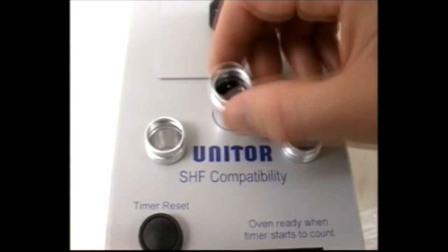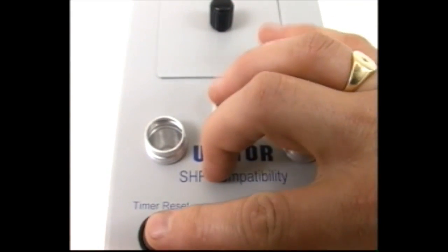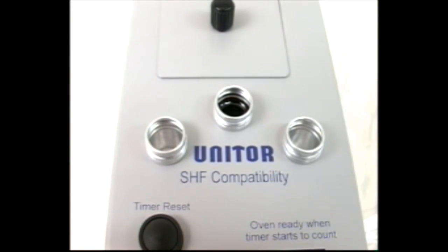After the unit is fully heated to 100 degrees, place the tube in one of the preheat holes. Press reset, then wait for the timer to count to 20 minutes.